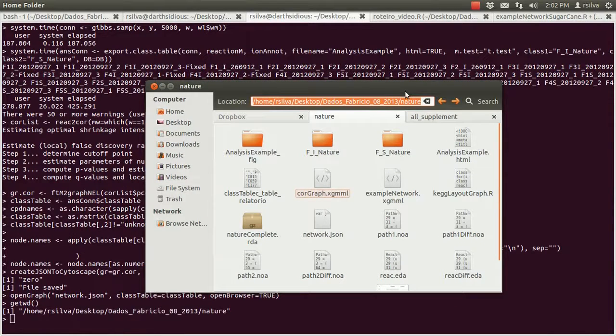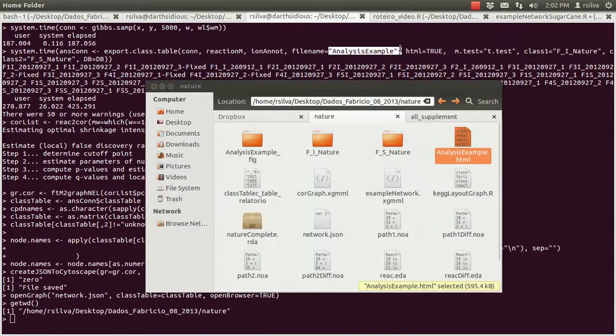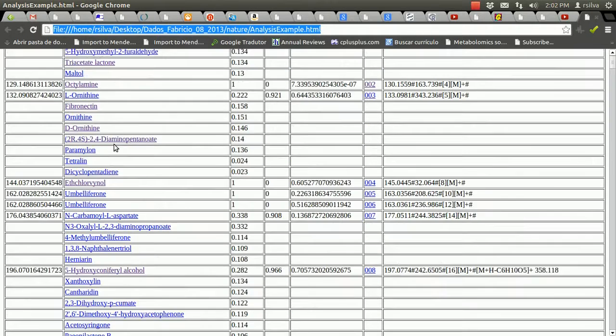The user can optionally export an HTML table with chromatogram peaks and link the ranking, database, mean difference and peak shape information. This table can be visualized locally with a web browser, and allows easy sharing through the web.